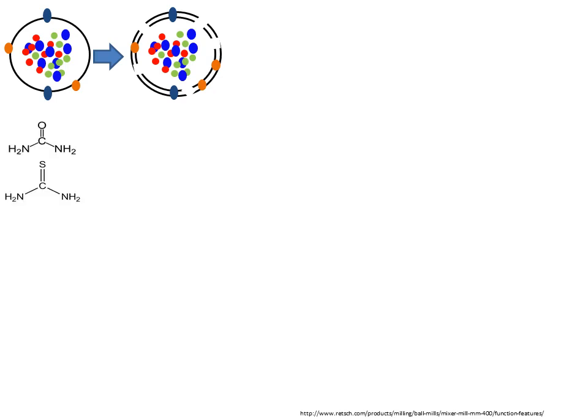But solubilizing proteins is just one part of the problem, the other part being breaking the cells open in the first place so that the proteins can be accessed and then solubilized. With samples of mammalian cells that are surrounded by lipid bilayer membranes, breaking them open is relatively simple, and often just adding chaotropes and surfactants is sufficient. Cells with rigid cell walls, such as bacteria, yeast and plants, are far more difficult.